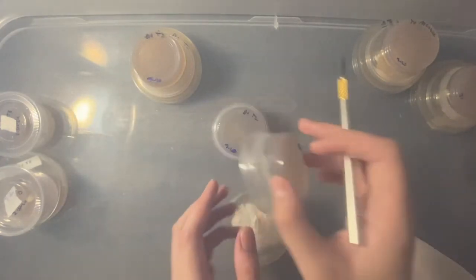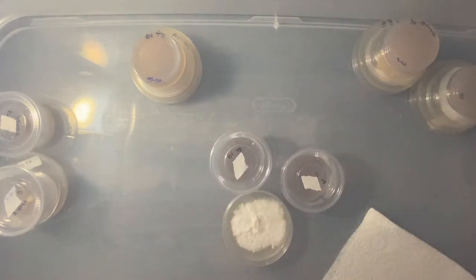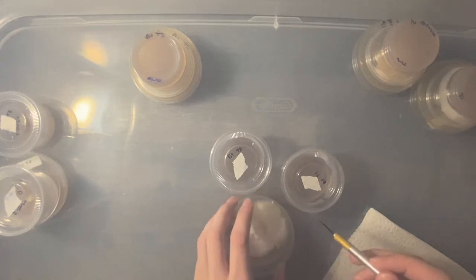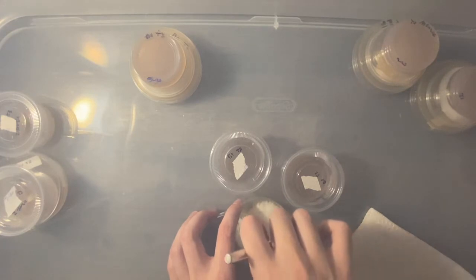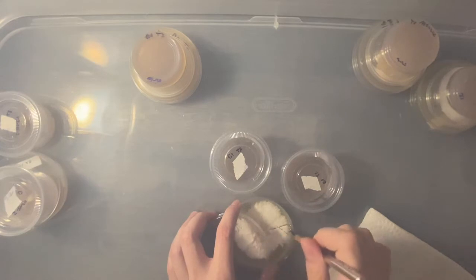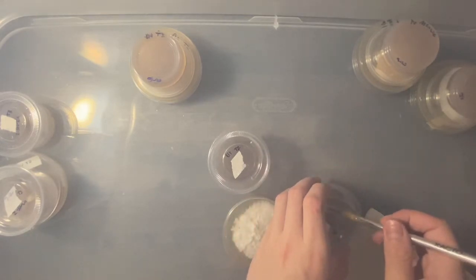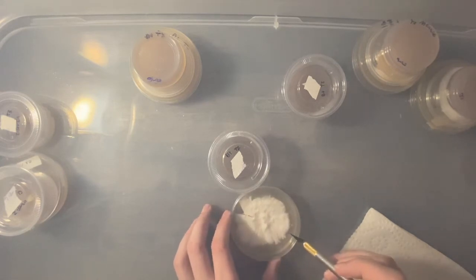But I have two plates ready for it, so I'm gonna crack the lids on those. And then I'm gonna flame sterilize my X-Acto knife. Alright, so I'm going to take this part first, right there. Okay, I'm going to put that one up there. I'm going to rotate this plate. I'm going to grab it from over here because that growth is really thick.